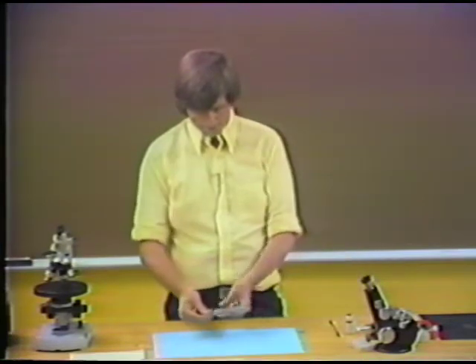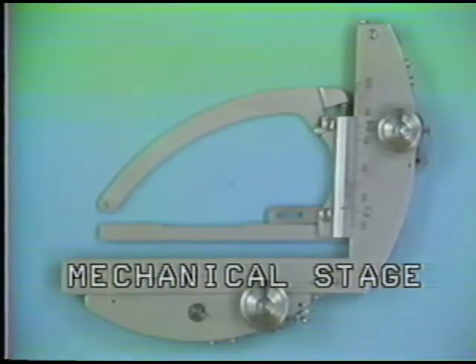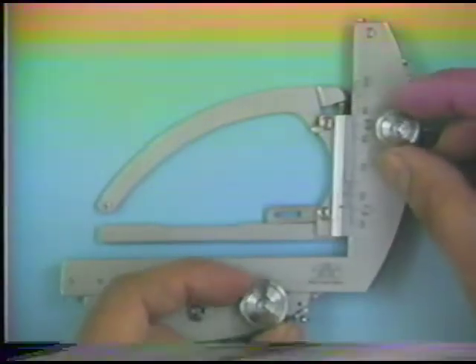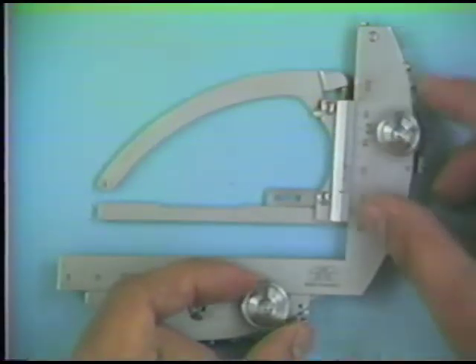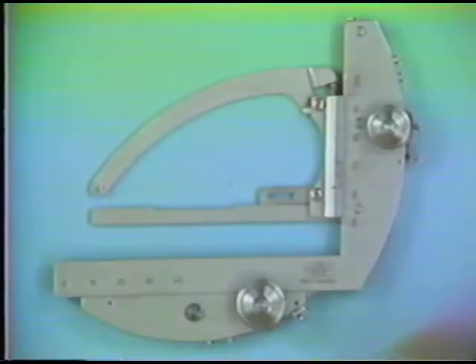This is a mechanical stage which you can position right on the microscope stage, and it has two screws in it which allow movement of the individual specimen in this sort of way. And there are graduations on these so you can precisely position any specimen.